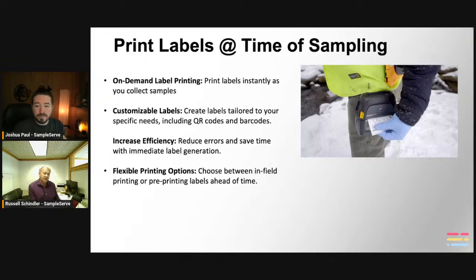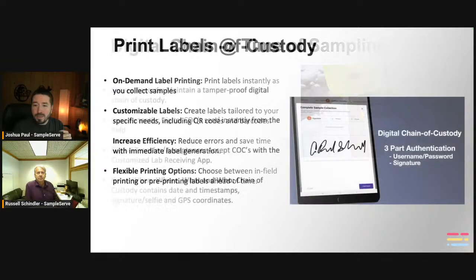If you print in the field, or if you're printing ahead of time, it's going to have all the relevant information except for the date and time. That's all you need to do: sign and date. Yep, and it's very easy.